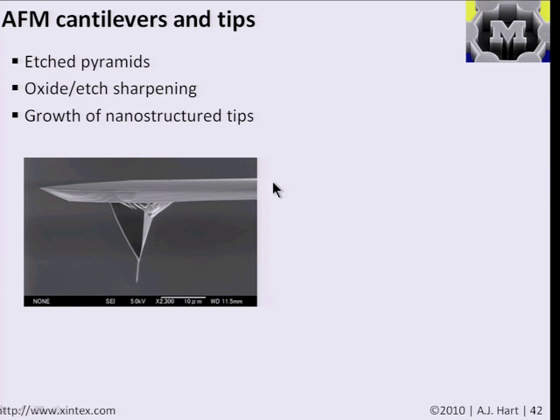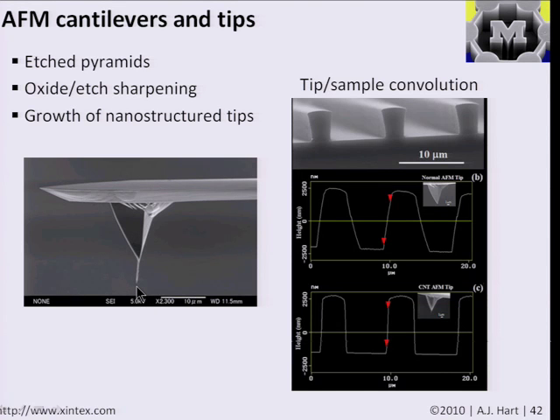And so there's a lot of technology to microfabricate these sharp tips using silicon wafer fabrication and growth and etching, and also adding things such as nanowires or nanotubes to the tips of these cantilevers. And this is an idea where if you have a very, very sharp and high aspect ratio tip, although in practice quite fragile, you can then image physically very, very intricate features. And that reduces what's known as the convolution between the tip and the sample, kind of the same idea I was trying to show you over there with my fist and the hole through the nanotube model.